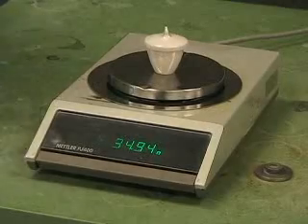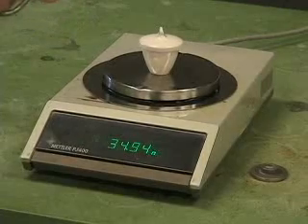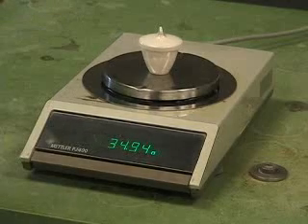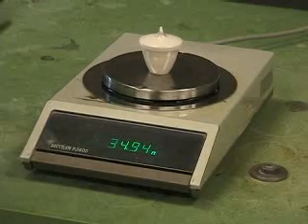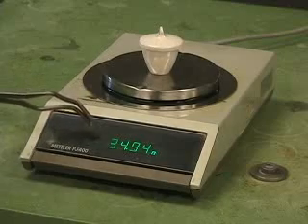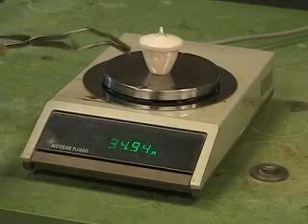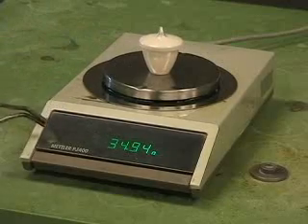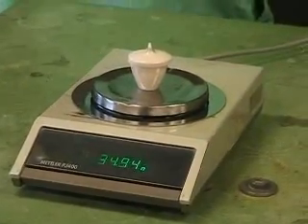After repeated weighings of the crucible — heating it, opening it up, weighing it after it cooled, heating it again, letting it cool, and weighing it again — I reached the point where the weight is no longer changing. You can see that the weight of the crucible plus the contents, which are now magnesium oxide, is 34.94 grams. So that's what I'm going to write on the board as the last piece of data that we need for this experiment.